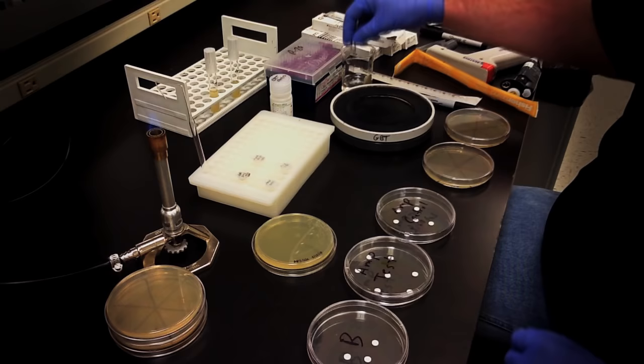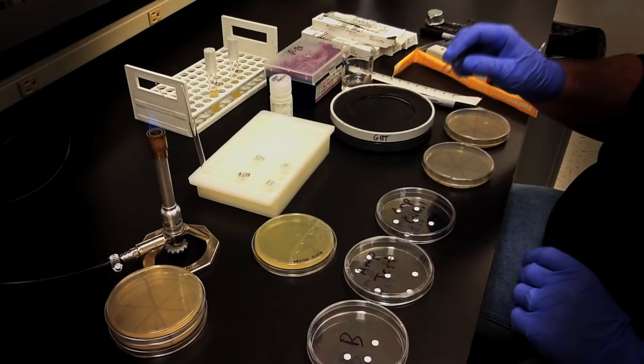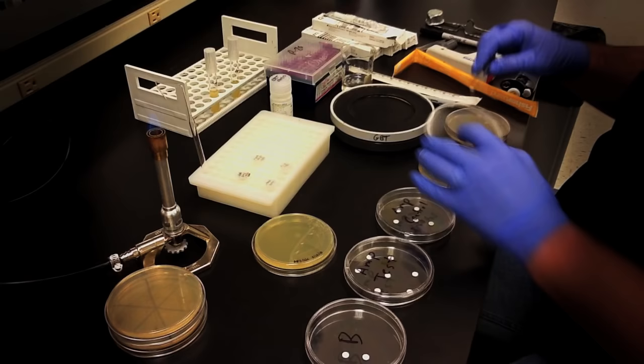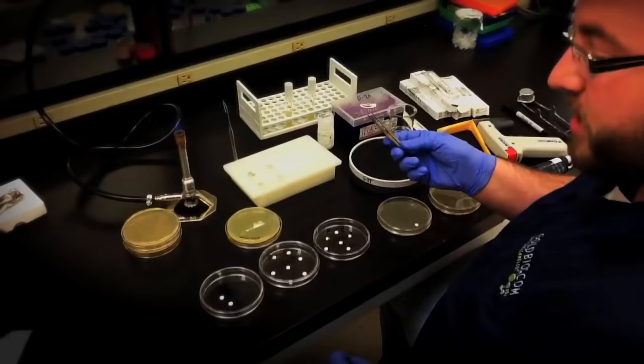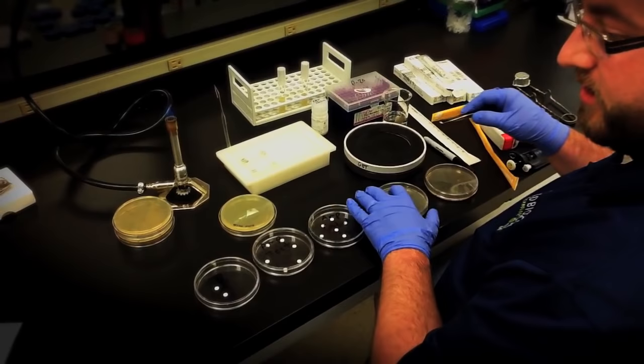Working quickly, you'll use tweezers to place the discs onto the center of the sectioned area, pressing them gently into place. You'll want to make sure to sterilize your tweezers in 70% ethanol between discs. For each plate, I always include a blank disc with no antibiotic and a purchased disc as a control.